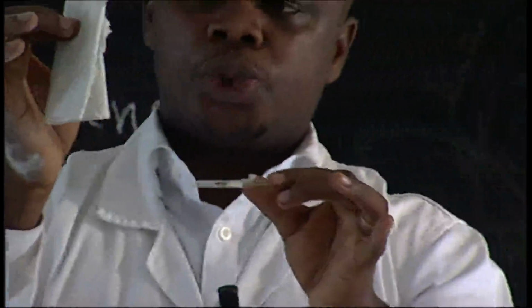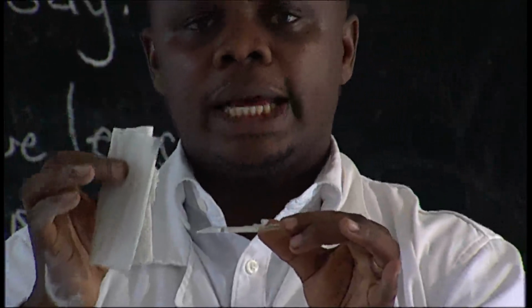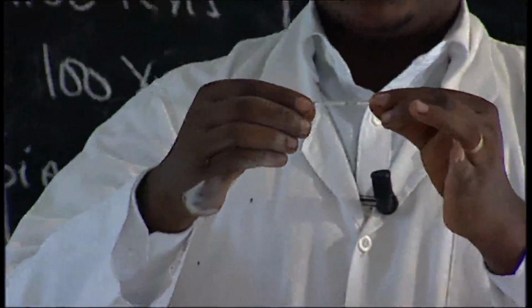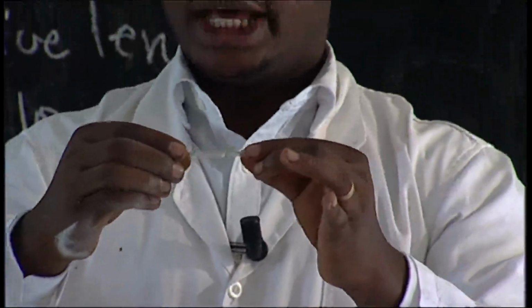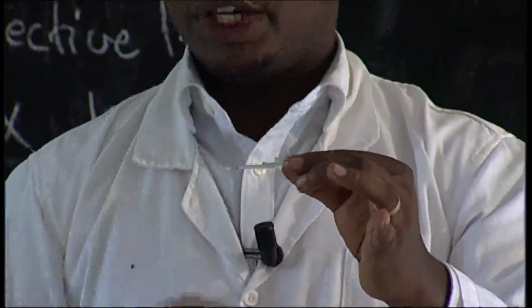You can see the tissue is wet, which means there was excess water and excess iodine solution. After that, you wait for a few minutes, and then you put it on the microscope for observation.